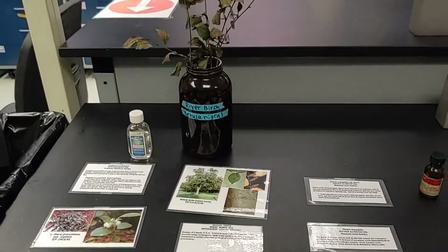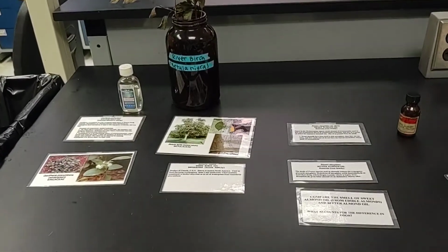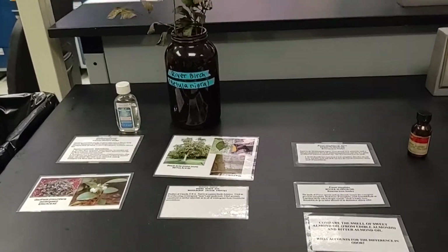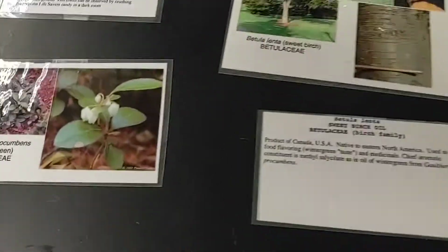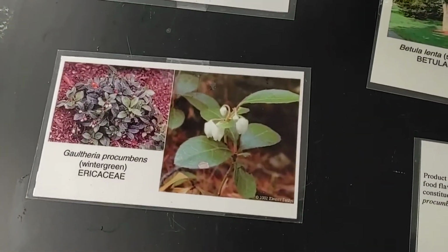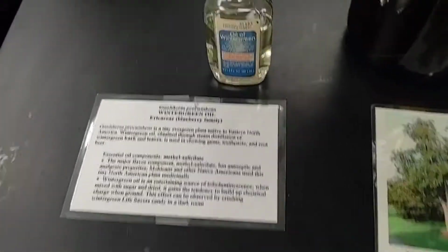I want to quickly go over the Essential Oils lab and tell you a little bit about what we did and the diversity of essential oils that were on display. So in this first station here, we have several different plants that produce very interesting oils.